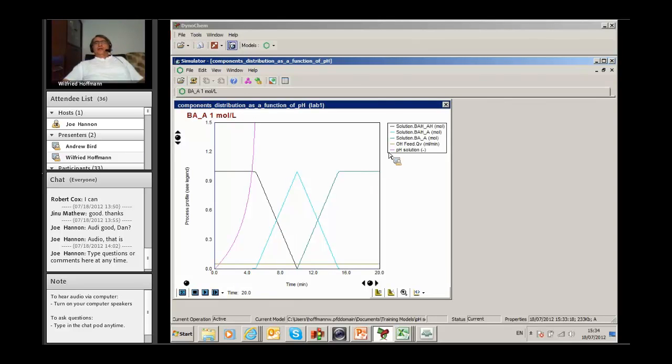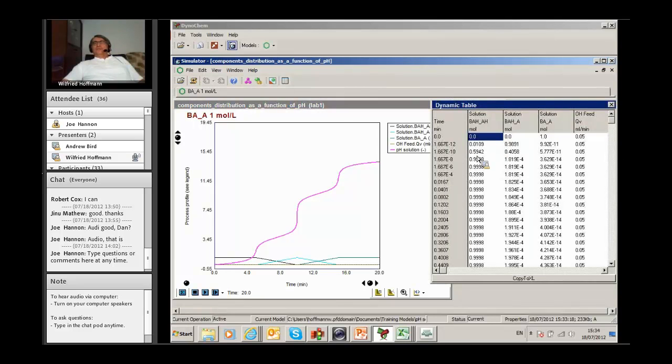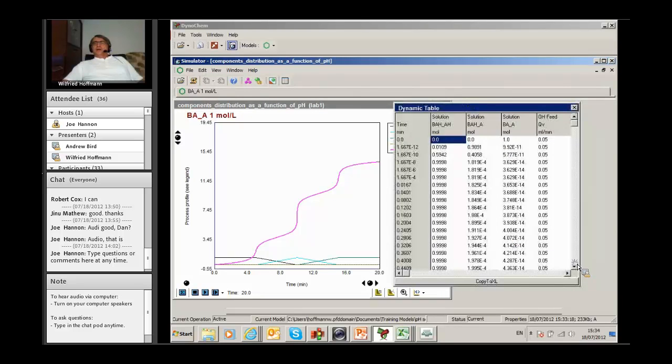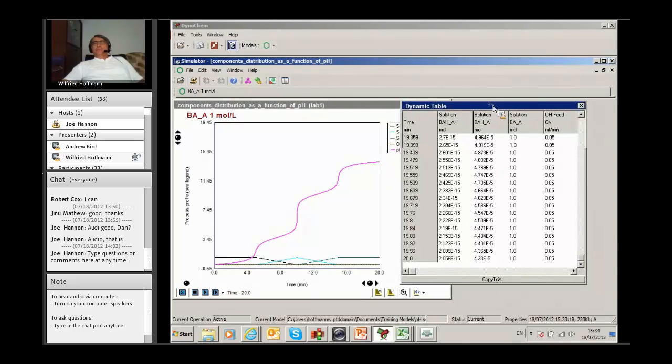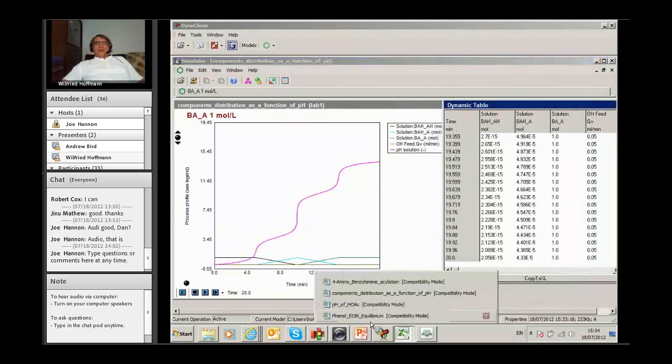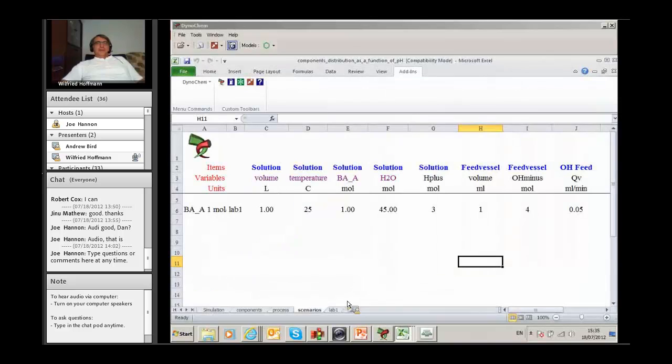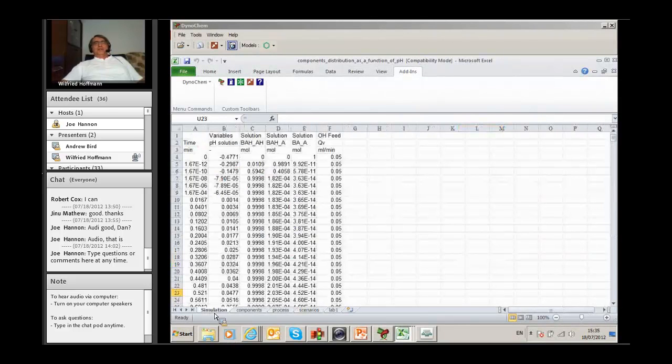If you look now for the pH curve, that looks a little funny because that is actually a titration curve. You know that DynoChem now as a function of, you can get all these numerical data in the table view. So if I press table you will see that all the data from the very very low value here till to the end are now tabulated. By pressing copy to XL, what happens is DynoChem, I show you, I have to do it here again, a new tab will be created where all these results are given.